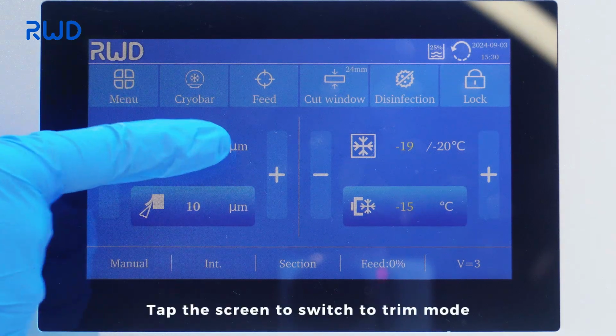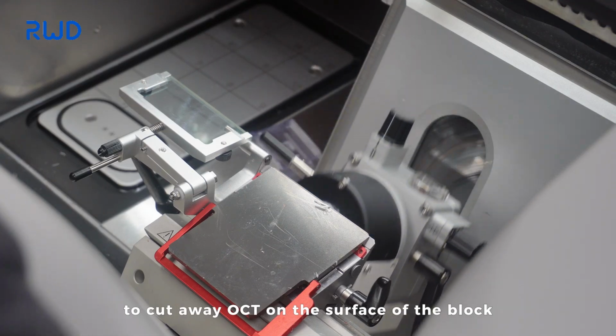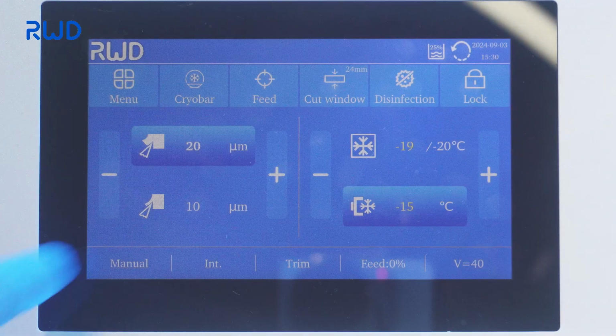Tap the screen to switch to trim mode. Turn the handwheel to cut away OCT on the surface of the block, exposing the target cross-section. Switch to section mode.